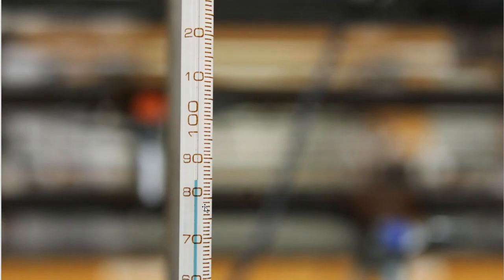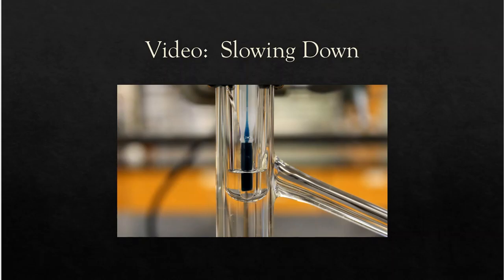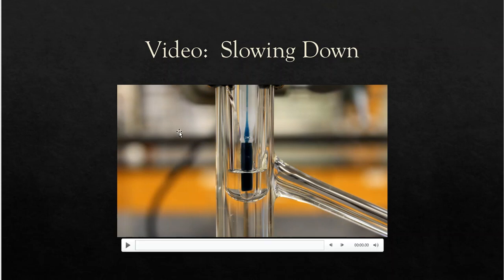Record what you see. So here is the thermometer, and here is the temperature at which the tremendous amount of bubbles started coming from that capillary tube. Now, that's not really our boiling point, but that is a temperature that I would like to write down to at least keep track of, okay? So you can read that thermometer just like I can, and you can make your observations and your data decision, okay? So now I'm going to take the heat away, and I'm going to let this solution cool, and I'm going to keep an eye out on that capillary tube.